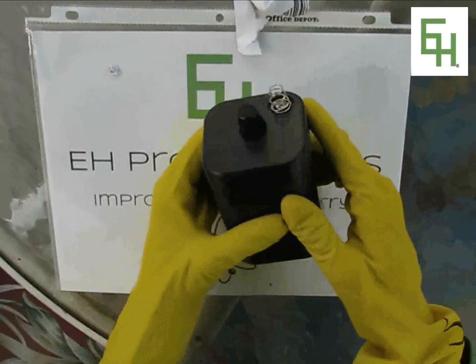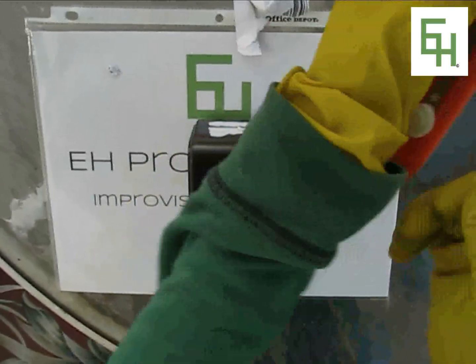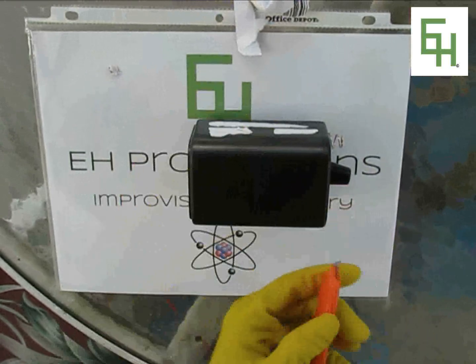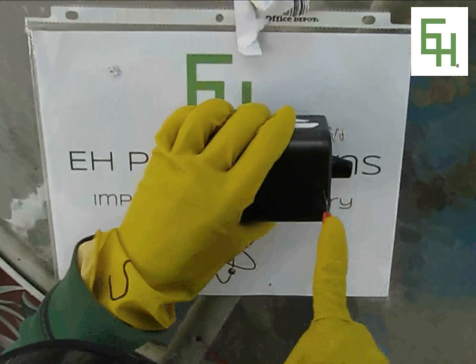So what we're going to do first — we're going to carefully get our knife. Pull up your sleeves if you have long sleeves. Carefully get the knife and pretty carefully cut the edge over here.